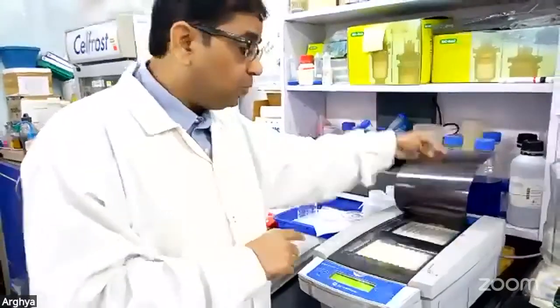I'd like to remind you again, a similar instrument setup can also be used even if your goal is not to do gel-based proteomics. For example, you can use liquid IEF, liquid isoelectric focusing, on the same instrument, but you are going to use cups. Those will be plastic cups where your entire protein will move across different cups with the IPG strip. And you can now take those fractions of your protein from different pH values. For example, between pH 4 to 7, you have 20 cups. Now the proteins have moved to the respective cup, and you are going to take those fractions which are specific to those PI values. And then you can run those in the mass spec, and then you pool the data. That is one way of fractionation.